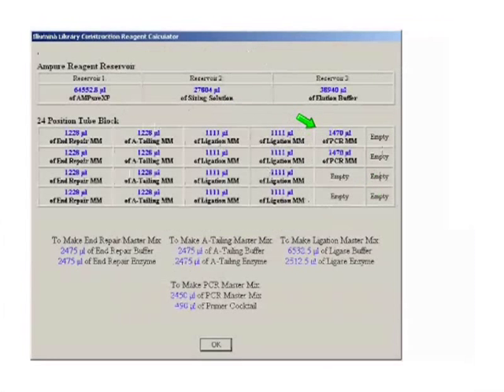And then I think one last slide that is actually very, very convenient, which is once you set those parameters and start a method, it comes up with very specific calculations of how much of each of the Beckman reagents to put in which wells, including how to make the master mixes up.